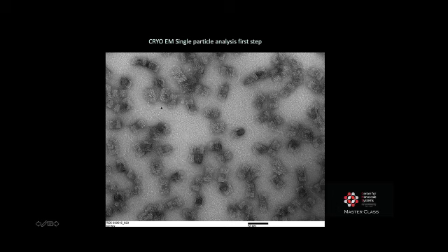It's clean. The only thing present is the protein that we're looking for. And we're lucky in this case that we have almost an infinite array of orientations of this protein. So by using computer generation, we can take all those arrays and then start doing our 3D reconstruction and start averaging images to get better resolution of this image.